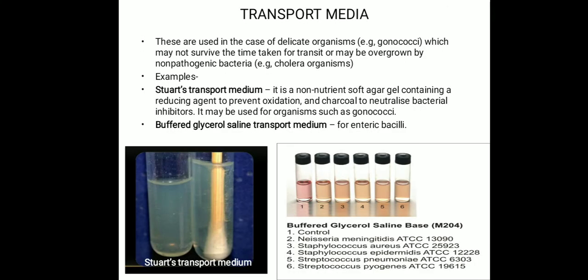Then next we have the transport media. We need transport media in some cases when we grow delicate organisms like gonococci, which may not survive the time taken for transit or may be overgrown by non-pathogenic bacteria if we leave them outside for a longer period and the culture is not processed as soon as possible.